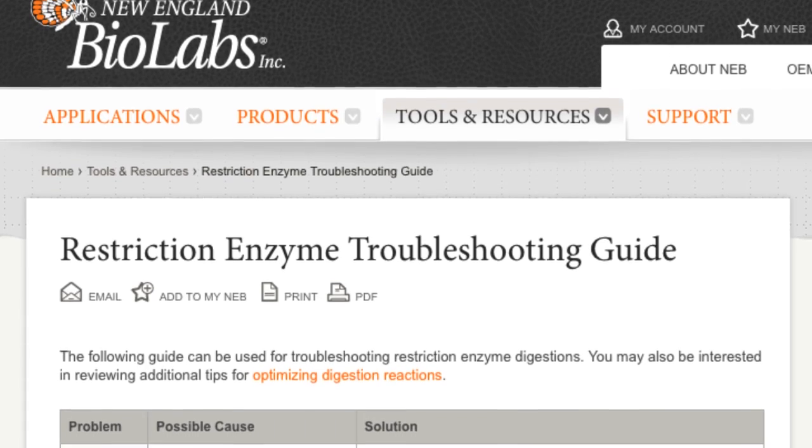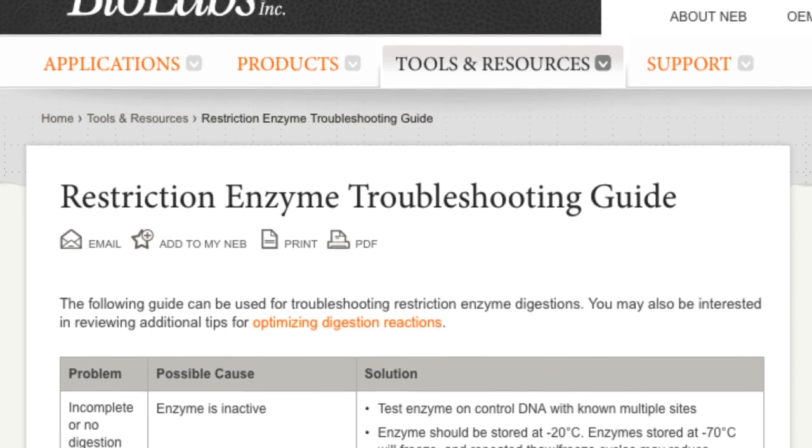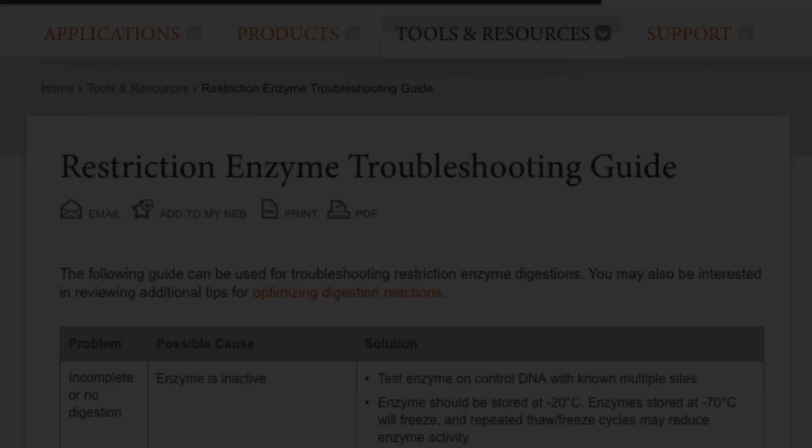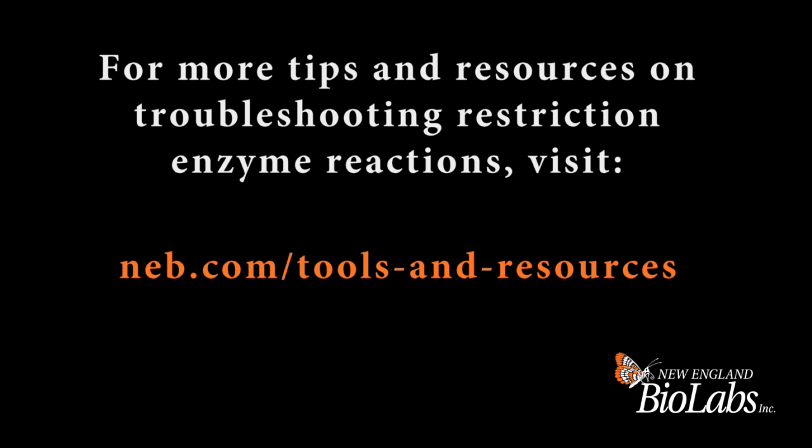If you have any other problems or are still troubleshooting, you can look on our website and our troubleshooting guide to help you, or feel free to call us and we can help.